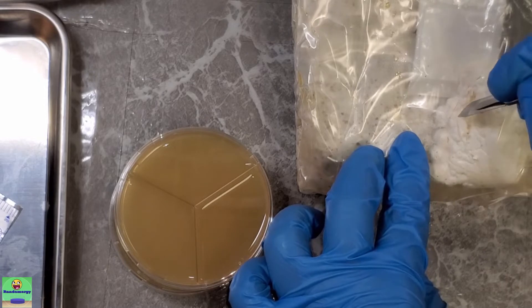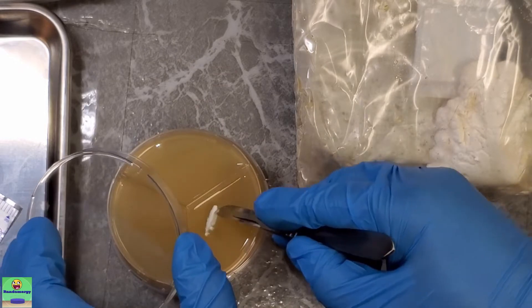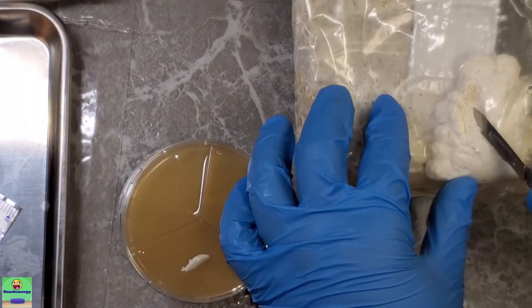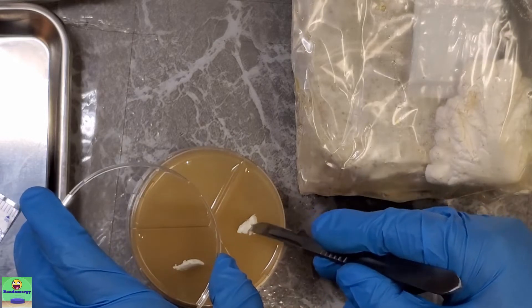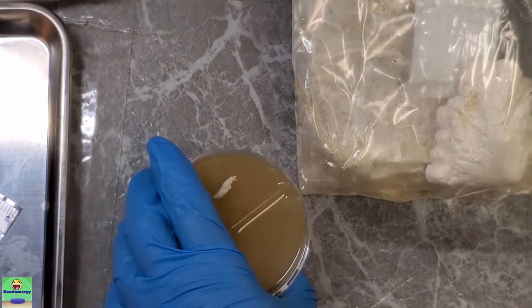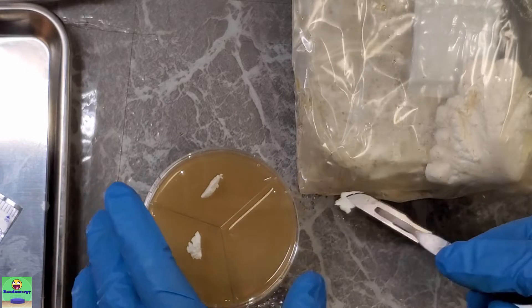This is exactly what you would do if you're trying to clone an oyster mushroom — just get a chunk of the mycelium or a chunk of the middle of the mushroom, cut it out, and place it on your agar. You know what, I'll just do four dishes.